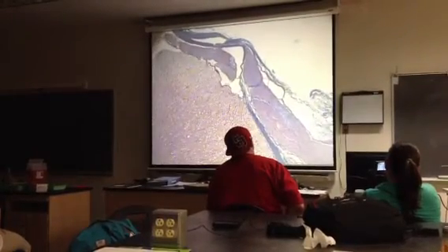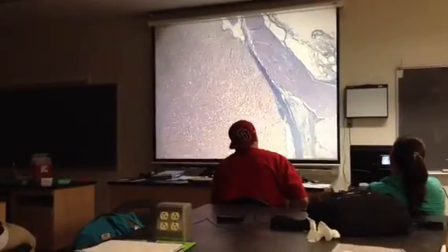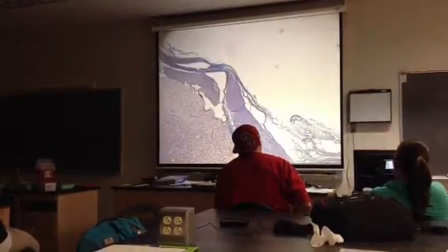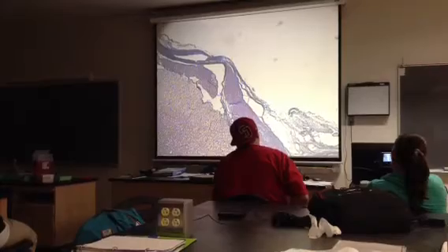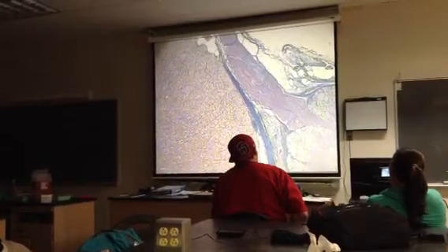Okay, the connection is a little messy right there, a little bit breaking off, but here you can see the what? What is that nerve? Somebody said it. This nerve right here. Dorsal root. That's the dorsal root. Yes, it is connected. These are the axons. It is connected over here to the white matter, though it doesn't look too good. It does connect. Okay, so then here's the dorsal root. That's the nerve with all the axons.